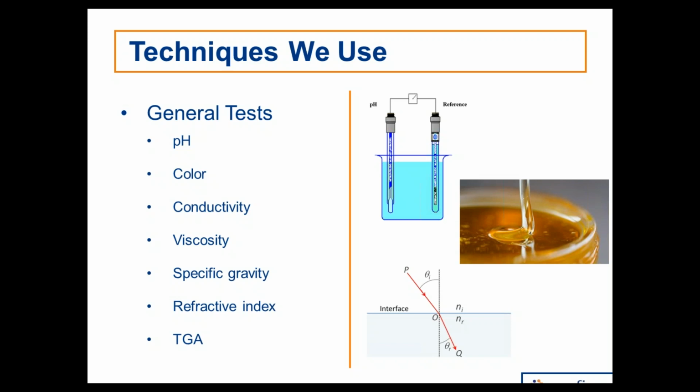And if a product has a chunk of glass in it, and it's a relatively large chunk of glass, that glass could be removed, and you could measure the refractive index of that glass, and it sometimes gives an indication of the type of glass it is as a first test. So these are actually tests that can guide us to further work, further study of the contamination.